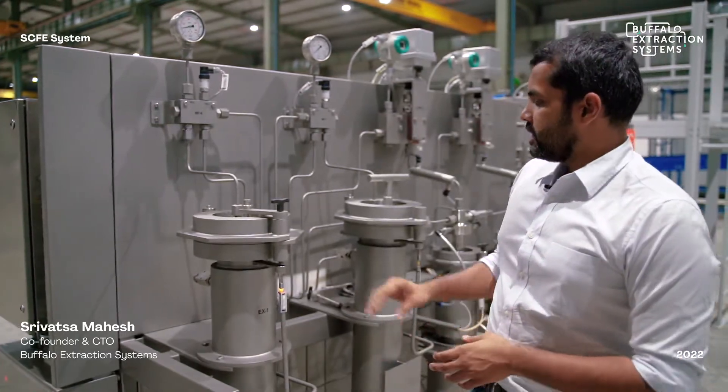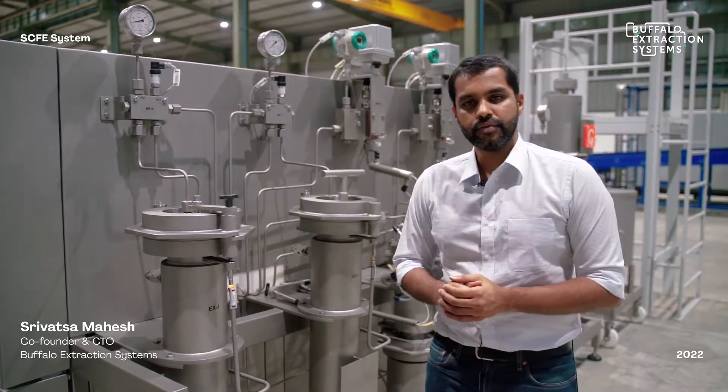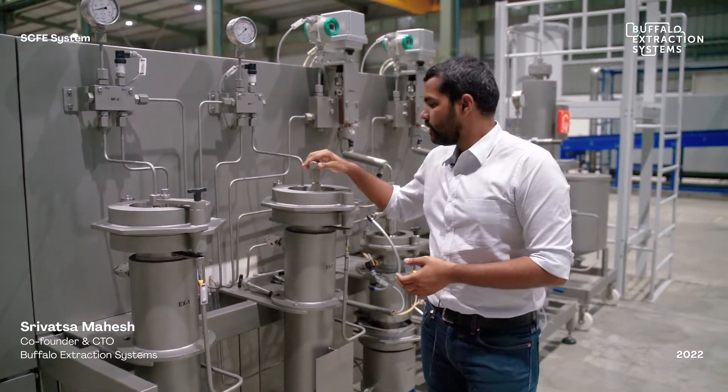The system is used to extract crude oil from a dry milled biomass of either hemp or cannabis. It mainly consists of the extractors, where the biomass is loaded, and the separators, where the oil is collected. Let me show you how the extractors are loaded with the biomass.